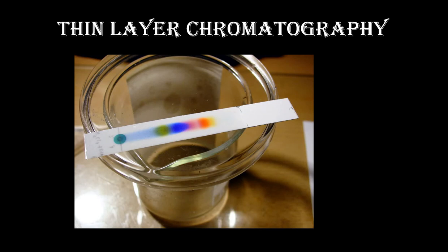Separation of the components from the mixture is carried out as the solvent moves upward, and we can then measure the distance traveled from the point of the spot to the middle of the separated spot. Here four spots can be observed on the glass TLC plate.